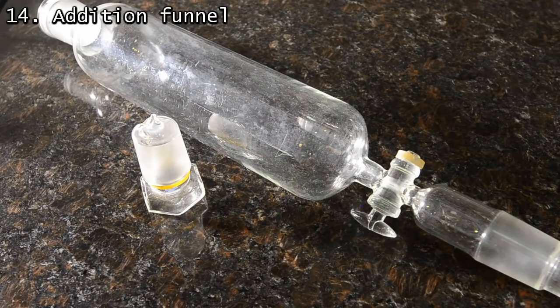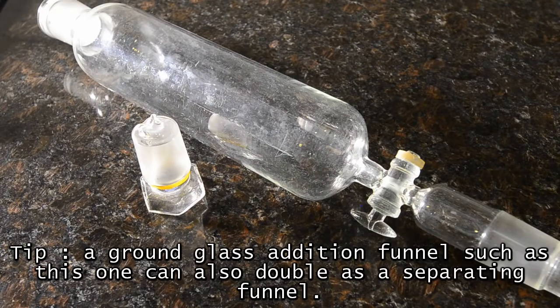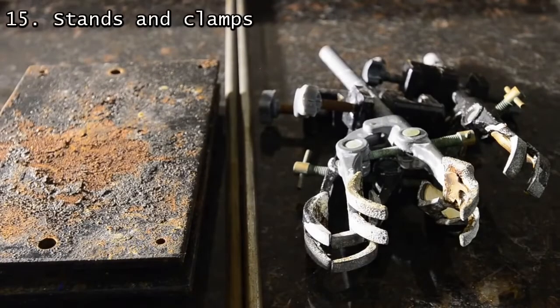Also useful is a funnel with a ground glass adapter — an addition funnel. We do have a very nice pressure-equalized addition funnel, but we managed to pick this old-style one up second-hand for around $10. It's our preferred joint size, all ground glass, and could also double as a separating funnel. Do remember, though, that there's no way to use ground glass without the right stands and clamps.